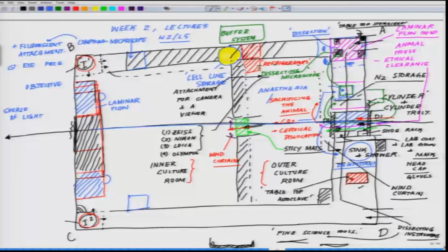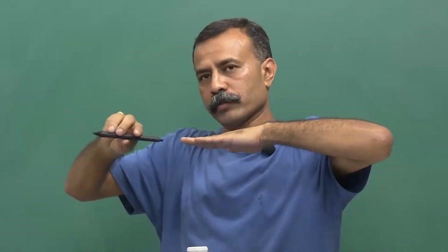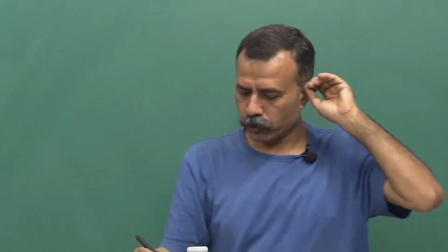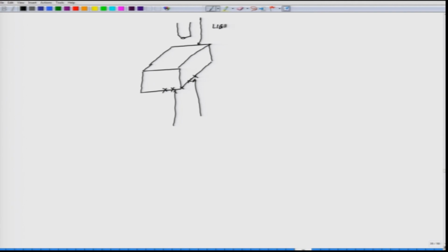Now, your options are two. So, say for example, this is where your sample is. The light source may come from the top, from the side, or from the bottom. Now, if this is the stuff on which the cells are, just to visualize it, let me put it in a slightly different way. Say you have this substrate through which, I am purposefully making it that thick, the light does not pass. So, your only way to view it is from the top, and you have to shine the light from the top. This is how you are shining the light, and the cells are growing on top of it, and you are viewing the cells.